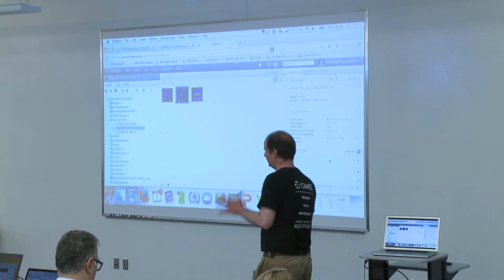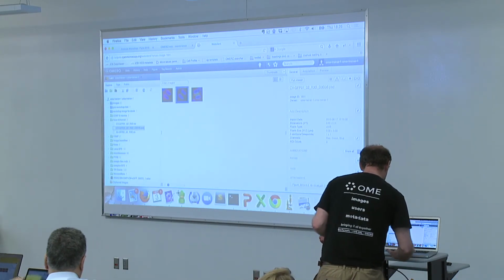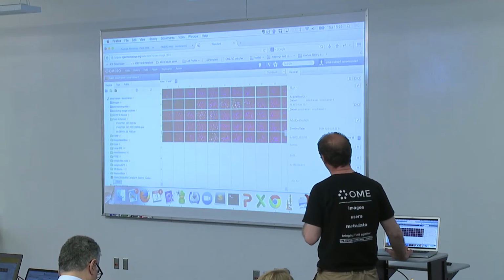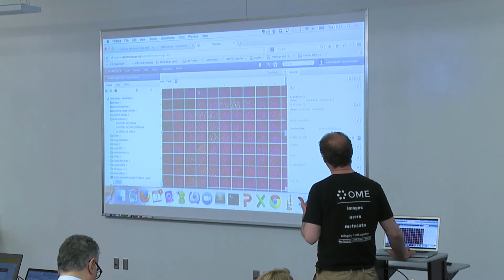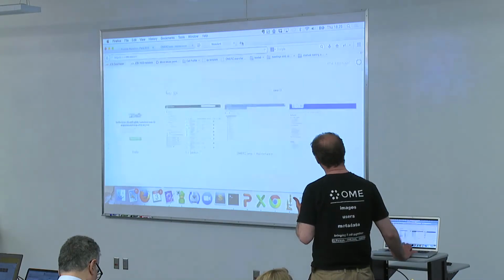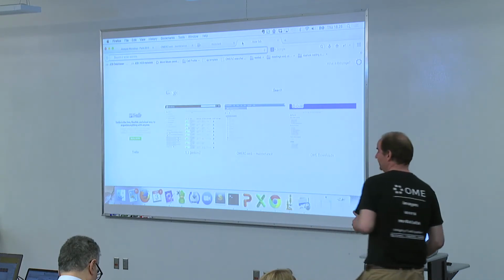To mention the high throughput screening, which we have some support here for as well. So if you go here, this is your plate with wells, right? It behaves like a normal image. Now this has been brought to another level in the JCB data viewer.